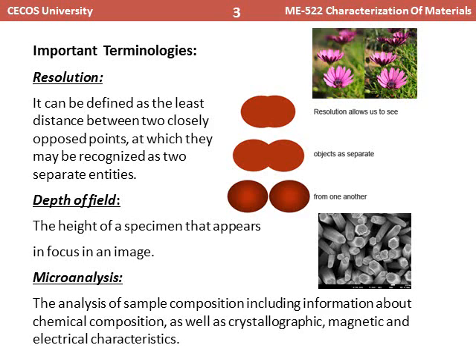By coupling the normal scanning electron microscopy with another tool called EDX, we will discuss it later, we can also analyze the composition of the structure.